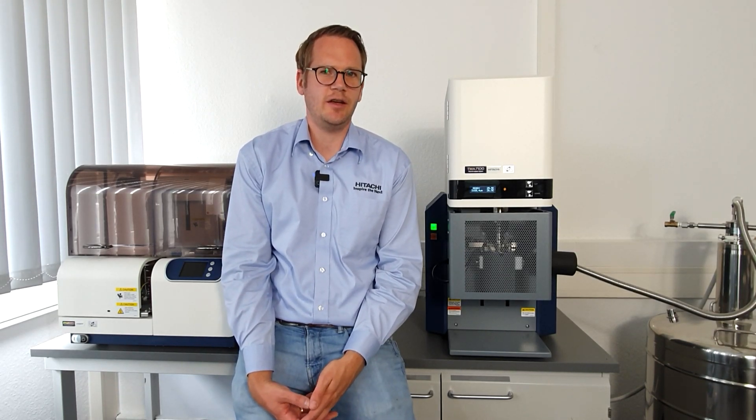Hello, my name is Martin Dehlmann. I'm the application engineer at Hitachi Hightech and today I want to introduce to you the TMA series.